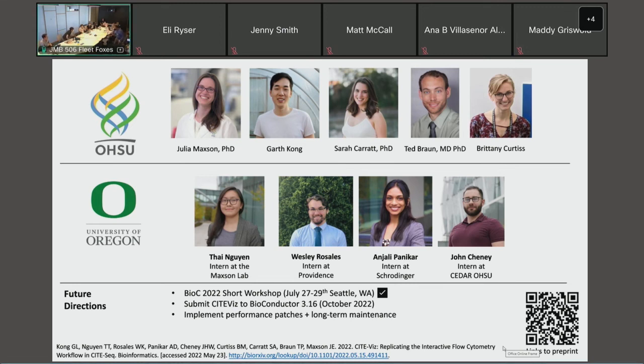So you touched on something in the process of discussing it. This tool is almost complementary to another, goes by the name of SCGate, that was published by the Carmona lab, and they concentrated heavily upon creating gating models and training them for splitting into pure and impure cells. And we have some experience with it. Ava was pointing out that it's going to be really handy to compare what we get with CITE-Viz versus SCGate, but it's also going to be tremendously handy to see where the differences are.